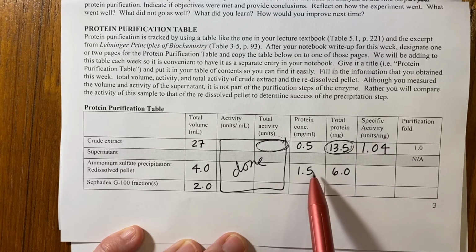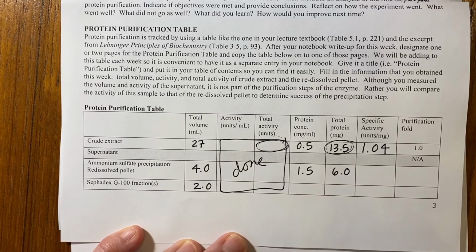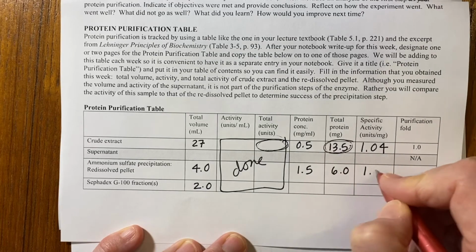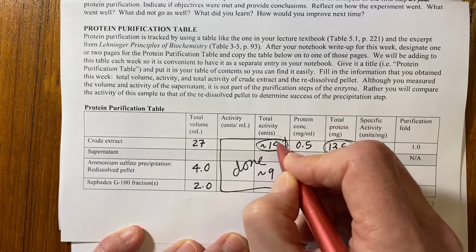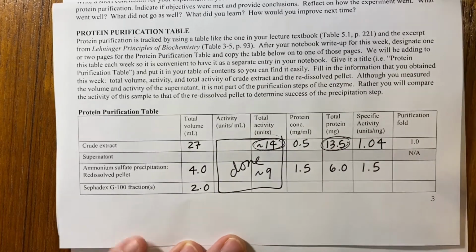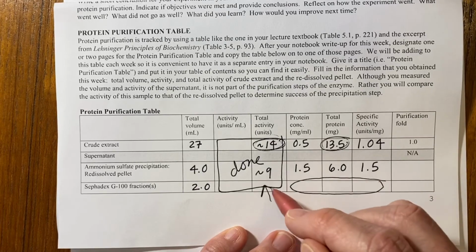For this one, it would be total activity here, which was about 9. So we'll say 9 divided by 6. That's going to be 1.5. So this is approximately 9, and this is approximately 14. That's how I got those numbers. You can complete this one based on what you got here.